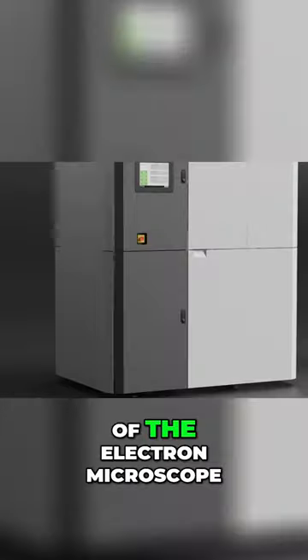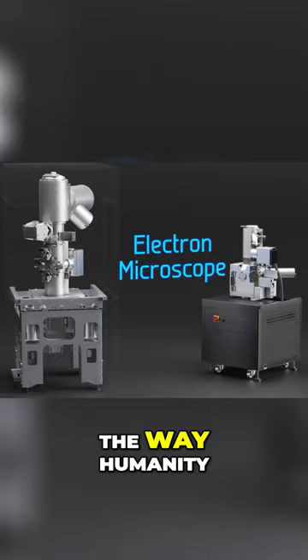That's the role of the electron microscope, which has literally changed the way humanity sees the micro and nanoscopic world.